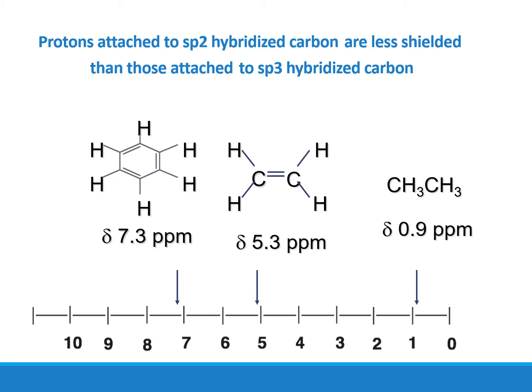in the aromatic double bond, the pi electrons are delocalized and resonance stabilized, of course, and because of this electron movement in the structure, which affects the electronic and magnetic properties of that hydrogen, they will appear very deshielded in the NMR reading.